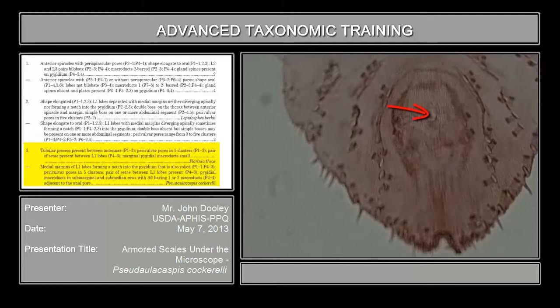Your anal pore is a dorsal pore for the excretion of waste material. Next to the anal pore, you see all these different rows of macroducts. The arrangement and the number in each of those rows is very specific depending on the species you're talking about, and it does not only occur in Pseudalocaspis — it occurs in several other genera. With this particular species, there are about three species that have one or two ducts associated or close to the anal pore. These ducts usually fall between the anal pore and where the perivulvular pore clusters are, or alongside them. The perivulvular pore clusters are ventral, the anal pore is dorsal, and the macroducts are dorsal. So in order to see a lot of this, you have to focus in and out both the ventral and the dorsal plane.